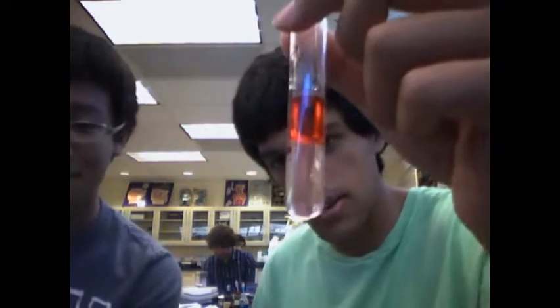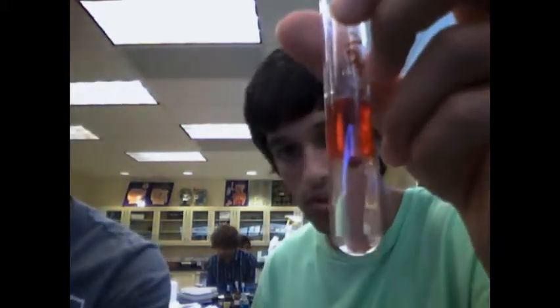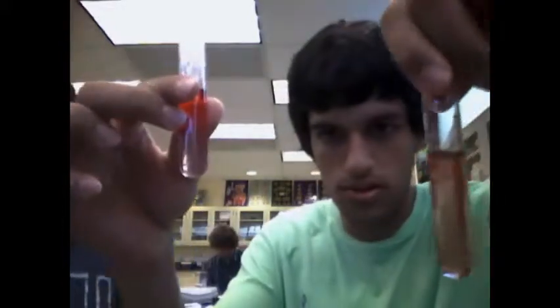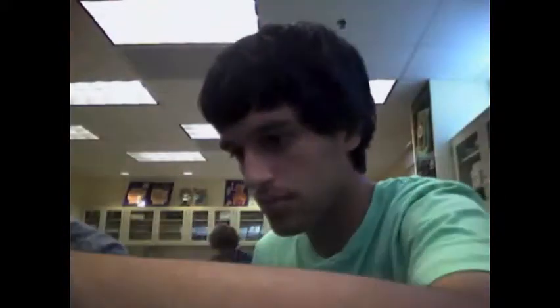Welcome to the Sudan reagents. Sudan reagents test for lipids. Here we have the positive test result with the vegetable oil and Sudan reagent solution. And this is a negative test result with water. So we can tell this is positive, this is negative.